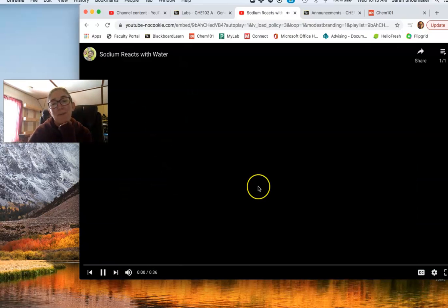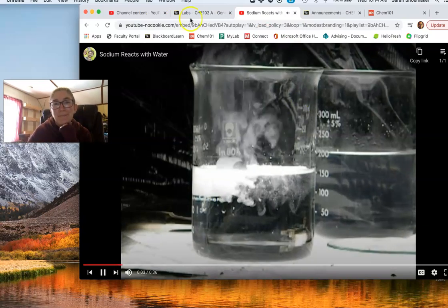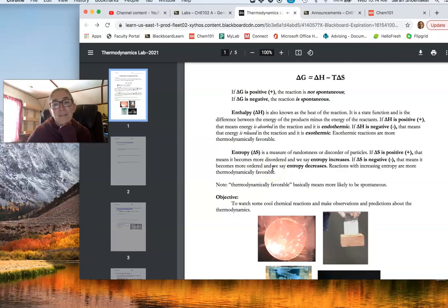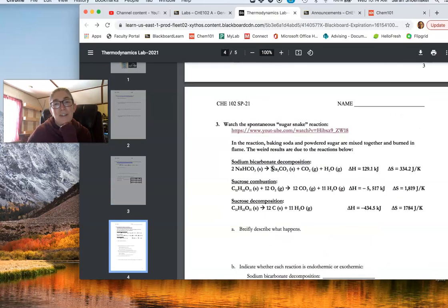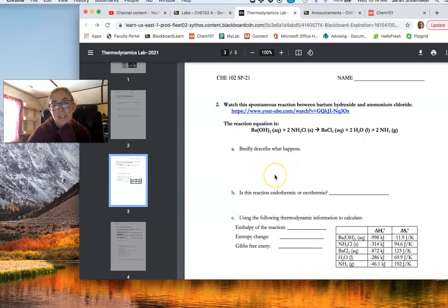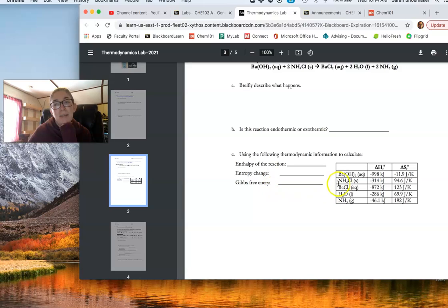There's also videos of people throwing like giant sodium chunks into like a lake. Okay, which I don't encourage you to do. So that's the first one. So then the questions are, it asks you to just briefly describe what happens, what were your observations, is the reaction endothermic or exothermic, and then a thermodynamic question here for you.